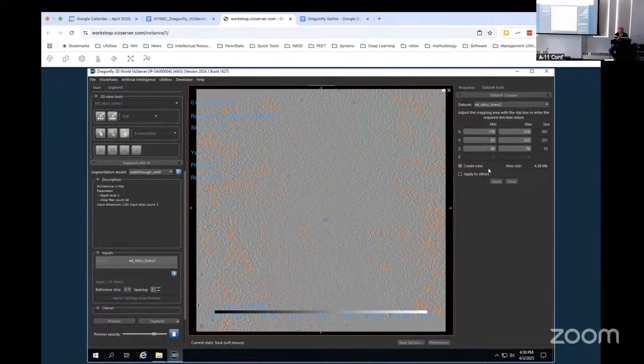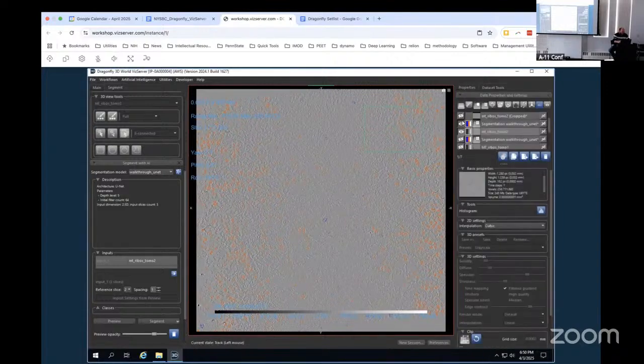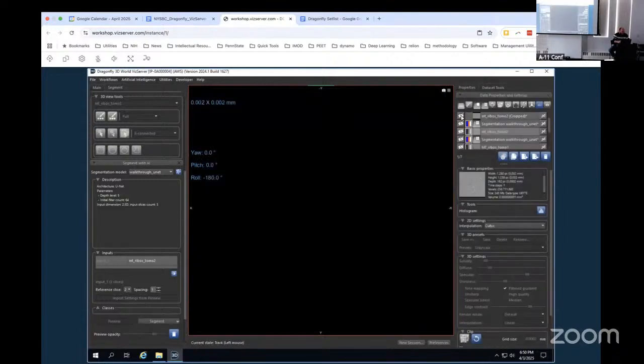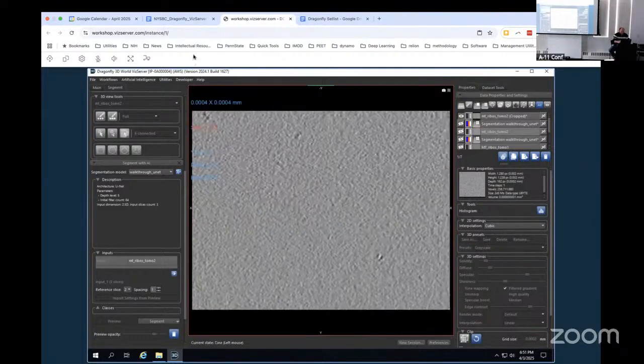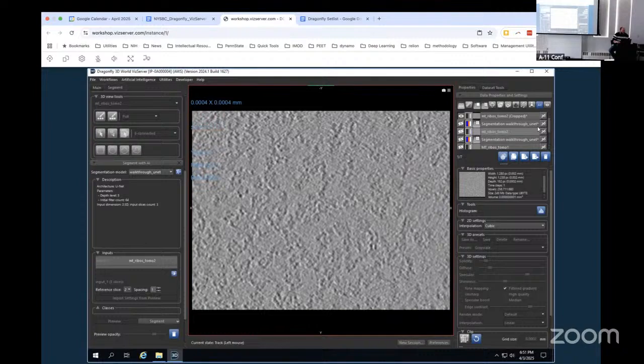Well, it's just going to crop out of. Oh, yeah, let's see what it does. Good point. Maybe it's in the right spot, but I don't think so. No, that looks terrible.